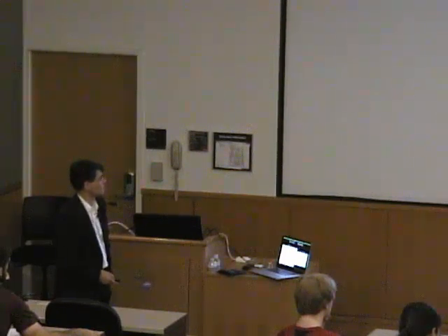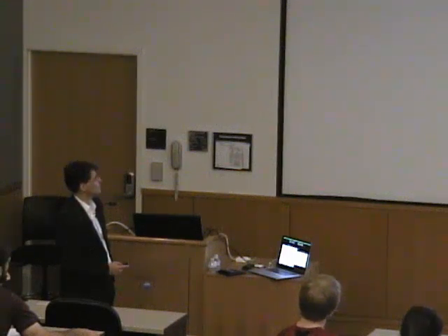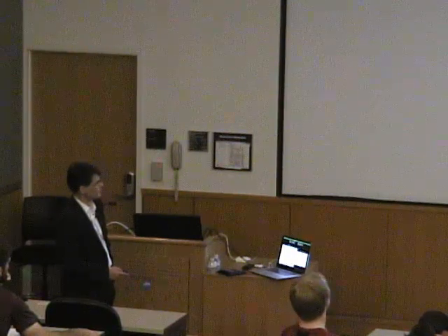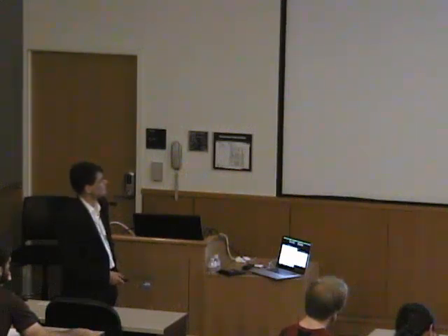Now, traditionally, the MCD signal is expressed in terms of three contributions, and I will explain to you what these contributions are a bit later. They are called A, B, and C terms. In that traditional way, the signal is always linearly proportional to the magnetic field. So the traditional way to look at it carries only up to here, and starting from here the theory is wrong because the signal is saturating and no longer linearly increasing.